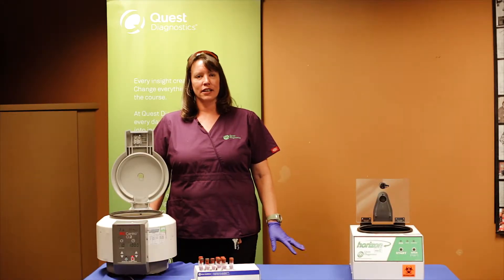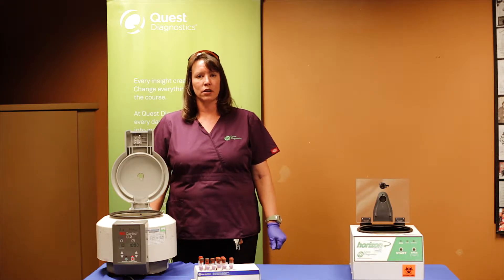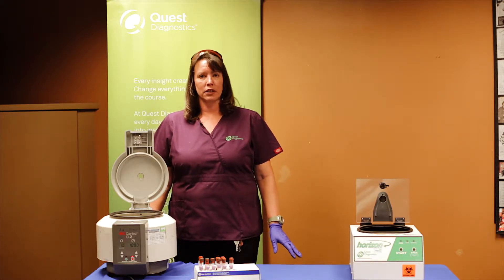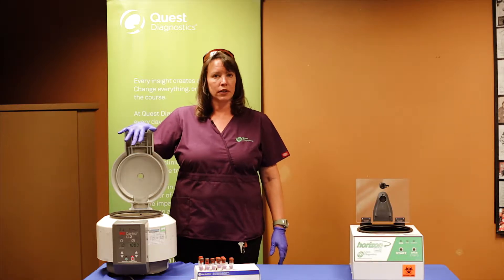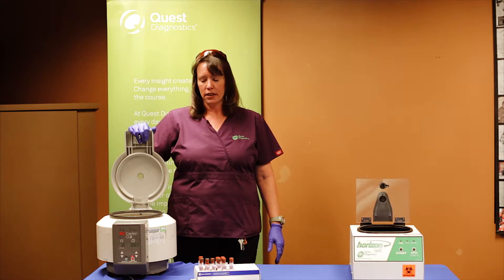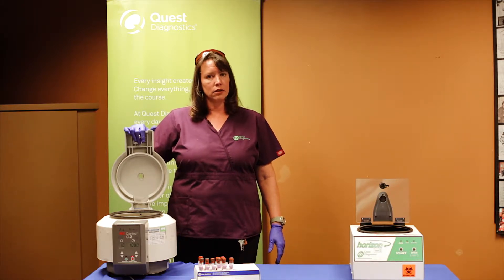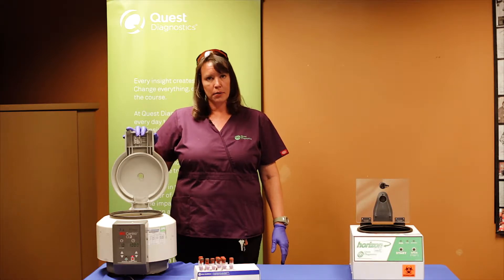Hi, I'm Jeri with Quest Diagnostics Health Fair Department, and today I'm going to be showing you what our centrifuges are for the types of health fairs that we do. What I'm going to be showing you today is our big centrifuge that most of the time will be out at our statewide sites. This is called a CL2 centrifuge, and it is what's called a 16-cup centrifuge.